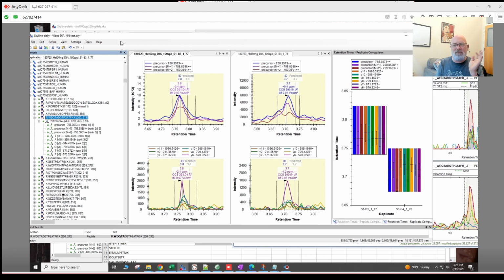So we're obviously close with the peak area boundaries. There are some errors there. I believe it has to do with the modification, like the oxidation or the deamidation. I didn't search deamidation, so it's probably the oxidation. So I think for oxidation, we just have to make sure the nomenclature in that report is the same.